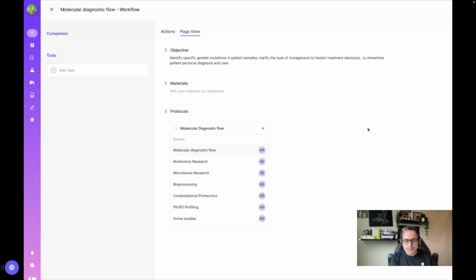The second thing I'm noticing when companies come to us is that they do want to build the LLM infrastructure, but they cannot directly ingest data from ELN and LIMS that is cleansed enough to go into their foundation model or their customized model that they're building in their generative AI infrastructure. So those are the two big things I'm hearing in the last few months. And I'm going to address both of them as I go through the use cases in these few slides.